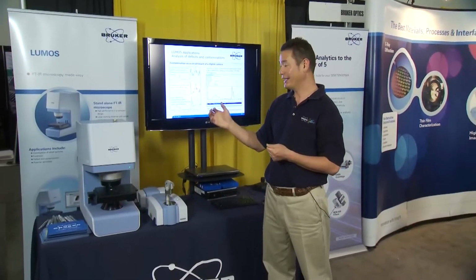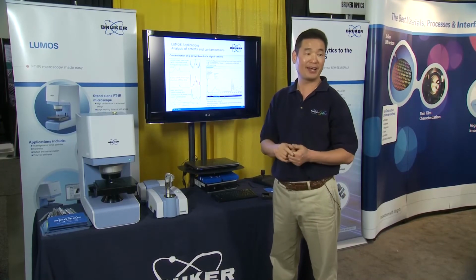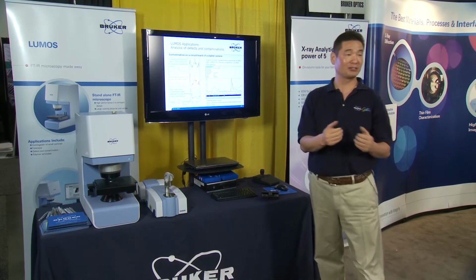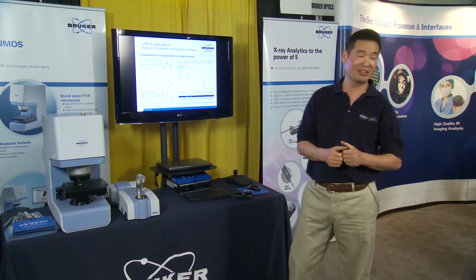It can be easily deployed in a typical lab for failure analysis and quality control. And if you're interested, come back to the booth and we can sit down, talk about more detail, and even test your sample.